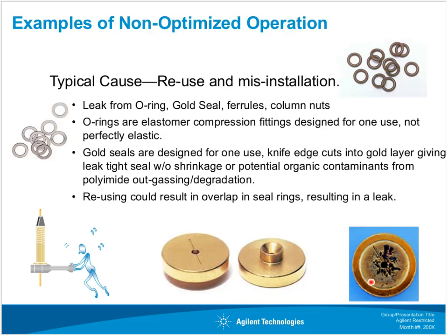With that, this is also a good picture not only for the residues, but see this nice shiny line in there? That's a groove that's created when you actually seal that reducing nut to the bottom of the inlet, which seals the inlet. So if you reuse these, and there's a little bit of wiggle room in that reducing nut, as you press that against the bottom of the inlet, if that seal doesn't line up perfectly, then you have a little channel where you can have a leak.